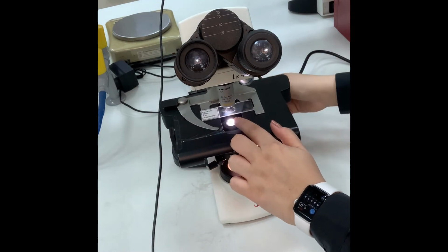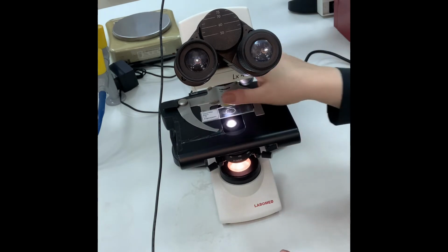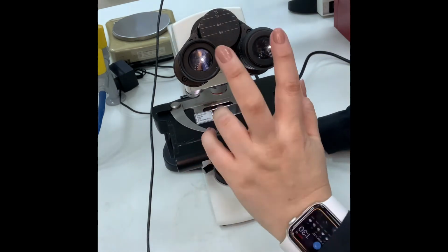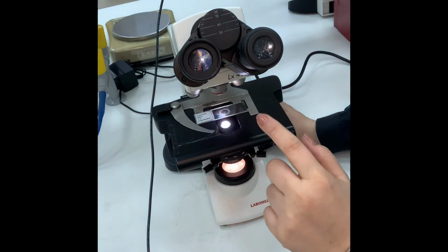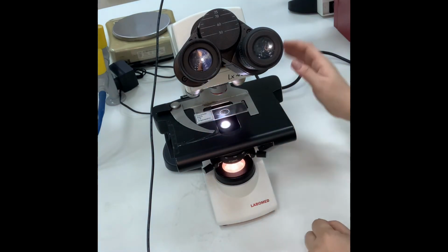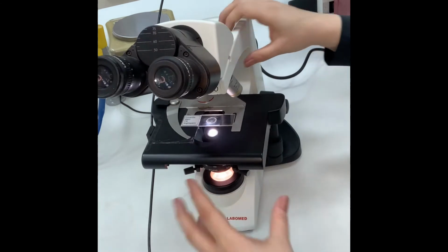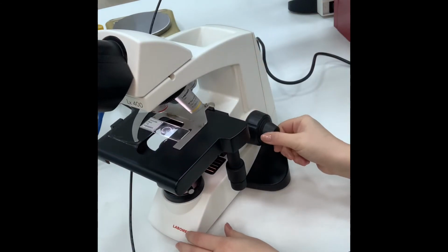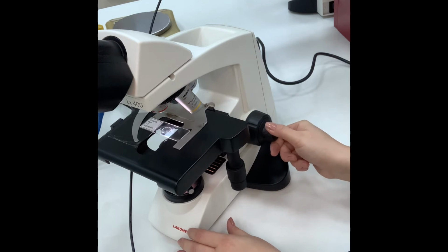So to be on the safe side, we use the lower magnification and your eyes through the oculars. Once you see the image, you will stop, even if it's unclear, and you will sharpen the image by using the fine focus.